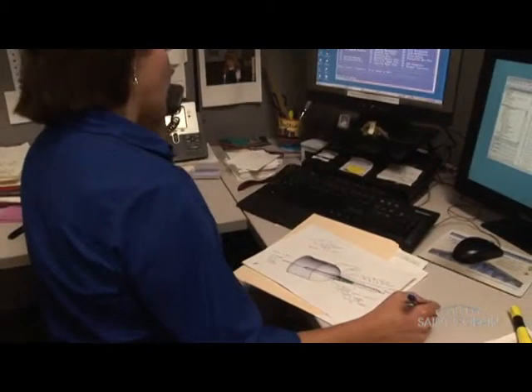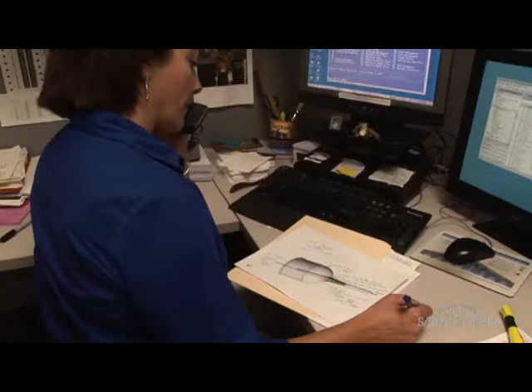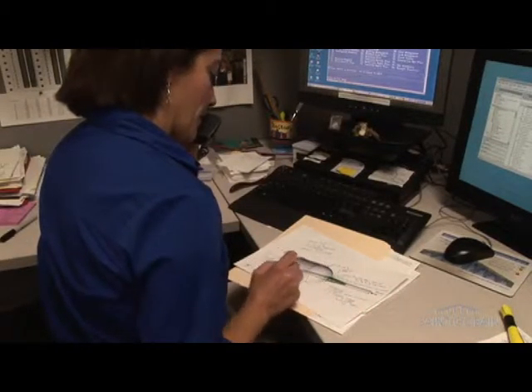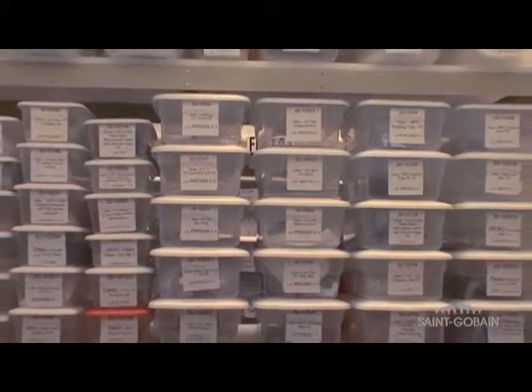In addition to manufacturing custom BioProcess assemblies, you can use Saint-Gobain as a resource for vendors to find the exact match for components like bags, bottles and filters. We can integrate them all for you, eliminating the need to find, purchase, inventory and assemble them yourself.